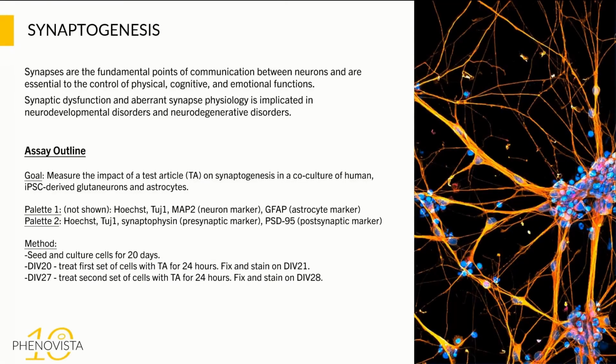So synapses are fundamental to communication between neurons. Healthy synapses are what allow neurons to talk to each other and to carry out their functions, resulting in physical, cognitive, and emotional functions in our brains. Also, dysfunction in synapses or aberrant physiology in synapses is associated with neurodevelopmental disorders and neurodegenerative disorders.